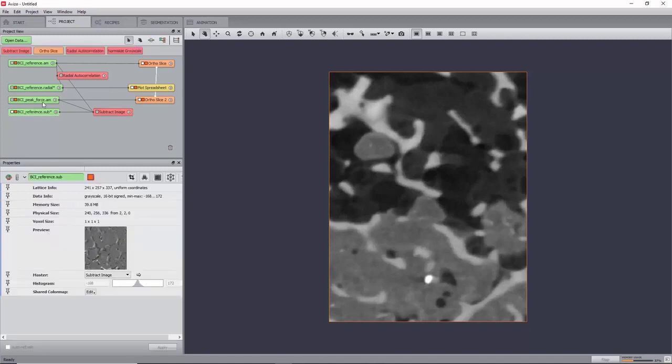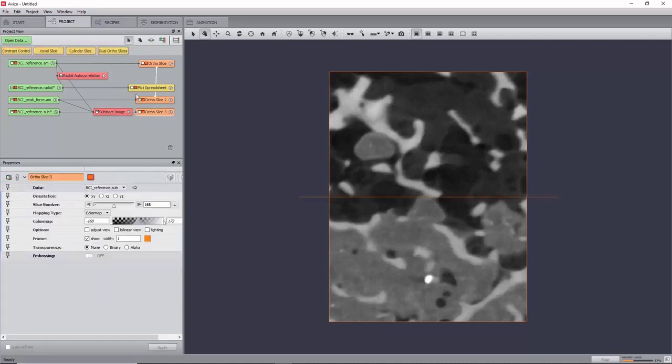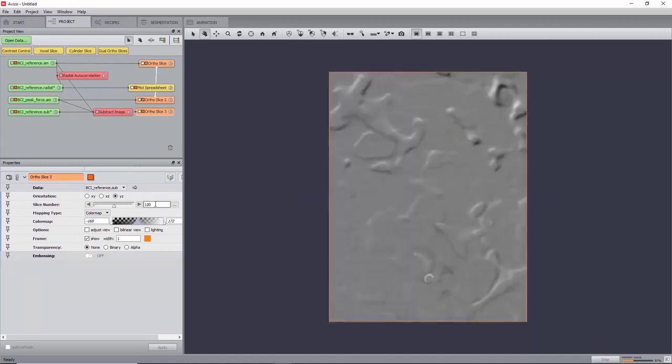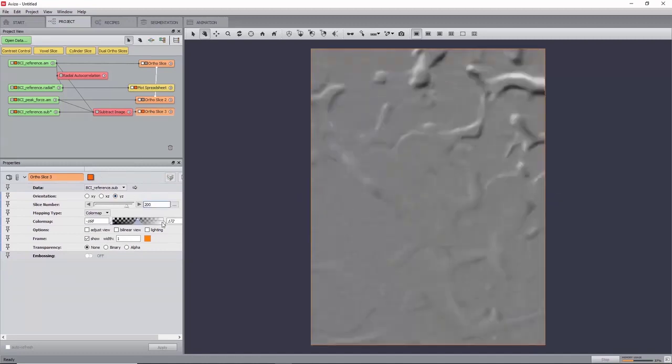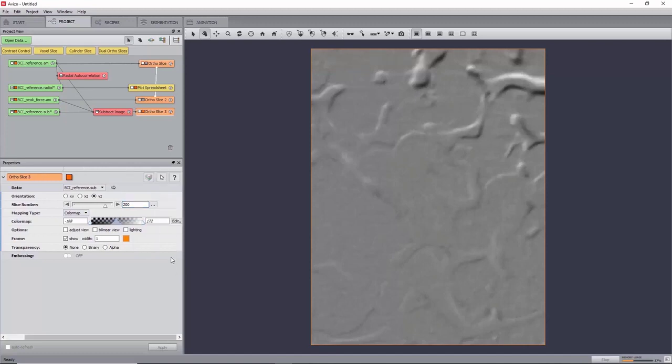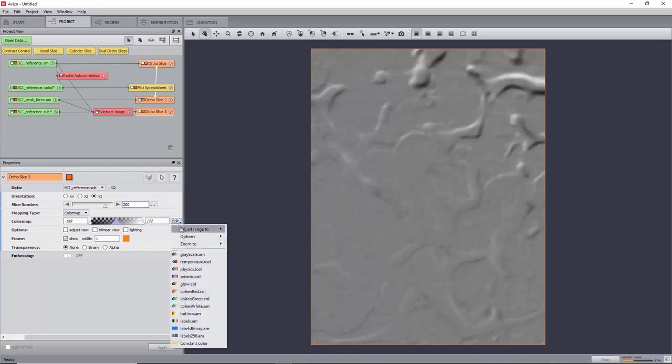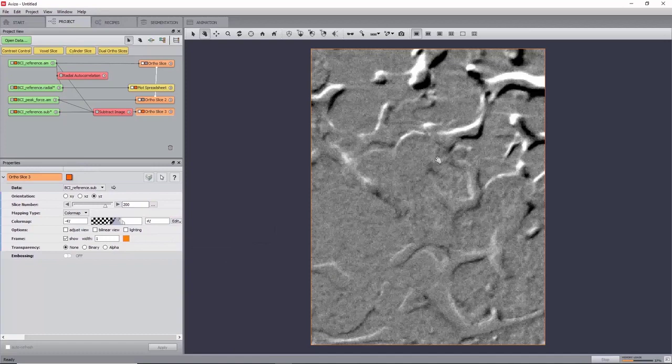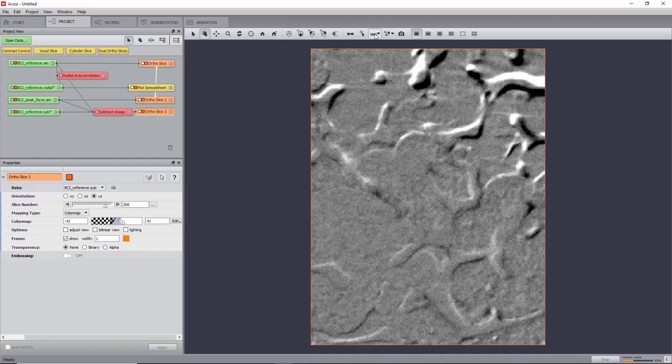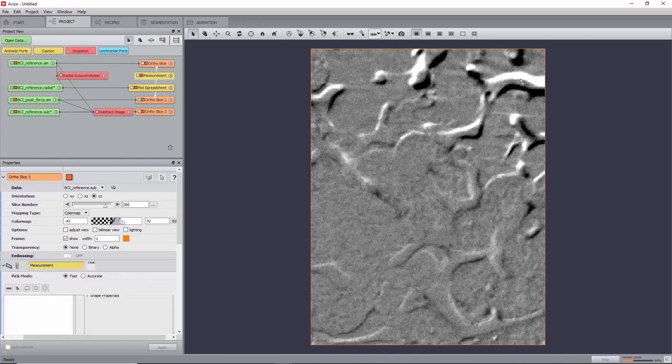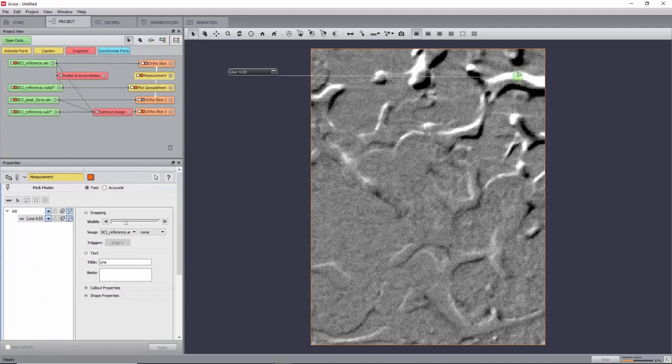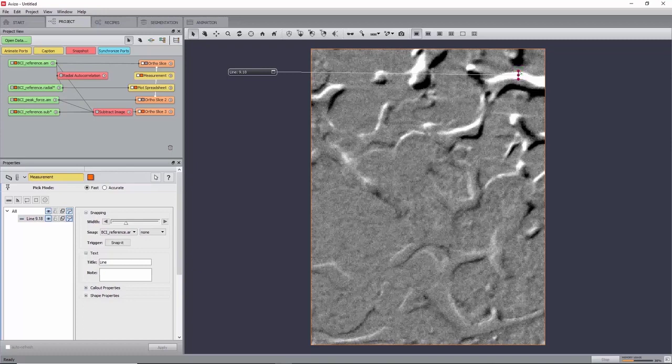View the resulting dataset with an autoslice and go to slice 200 in the YZ orientation. Adjust the color map by clicking Edit Adjust Range to Data Histogram. Parts with no deformation will appear in grey, and large deformation will appear as black and white fringes. Now use the Measure tool to have an estimate of the maximum thickness of either a black or a white fringe. Here we can measure up to about 12 voxels in the top right corner.